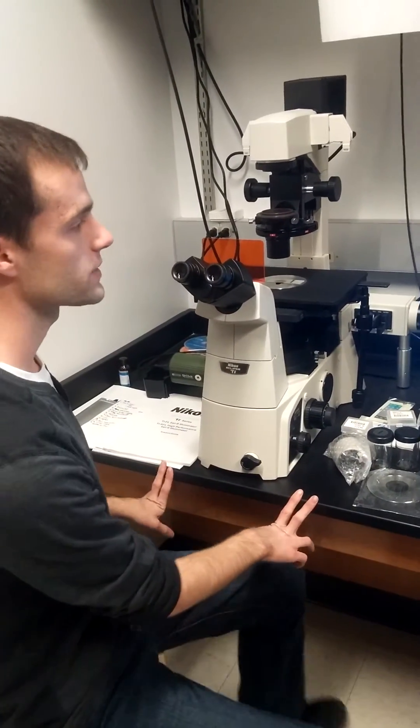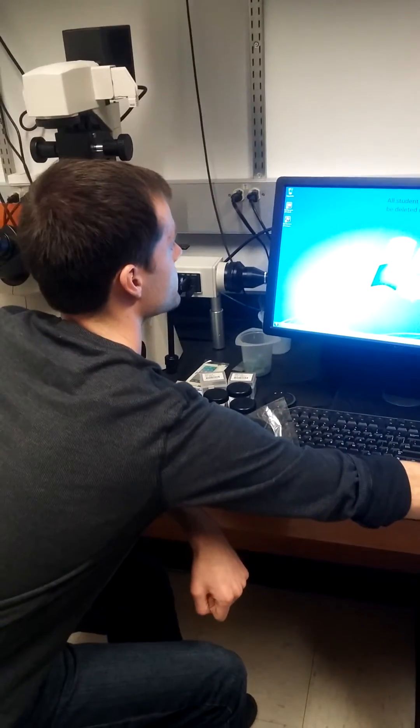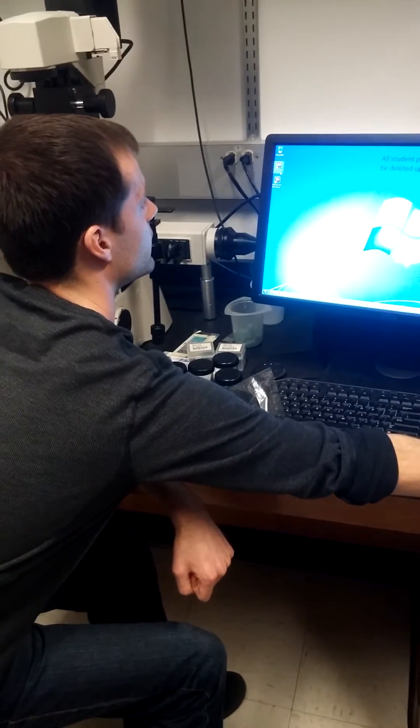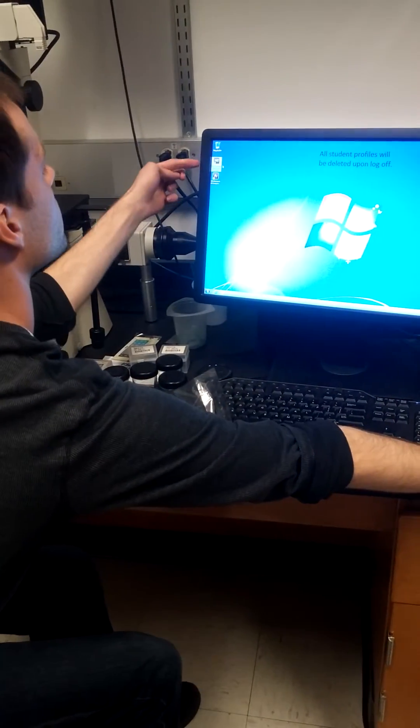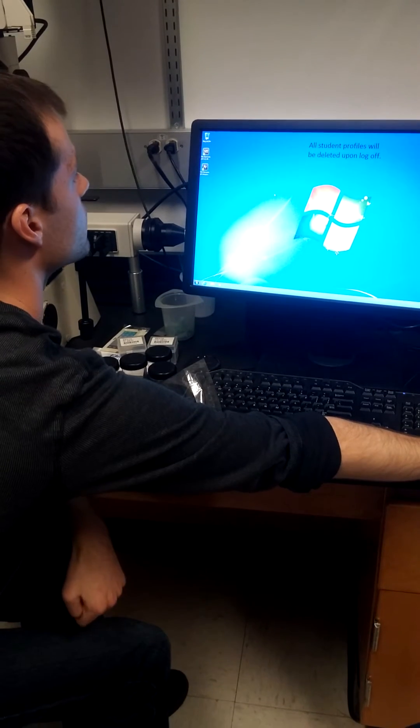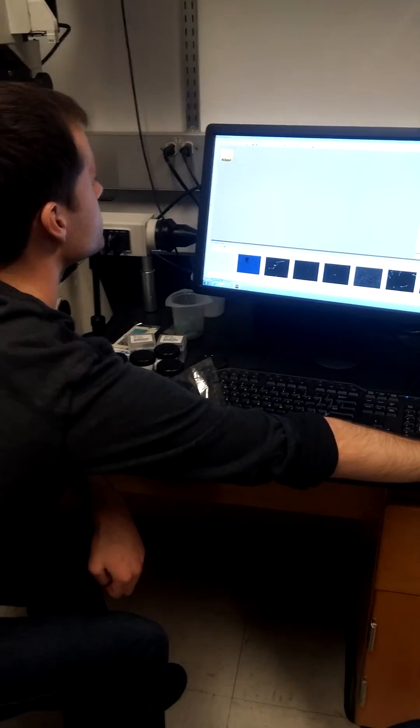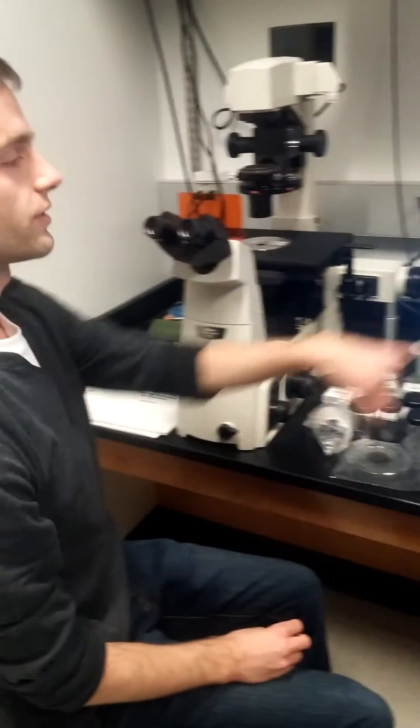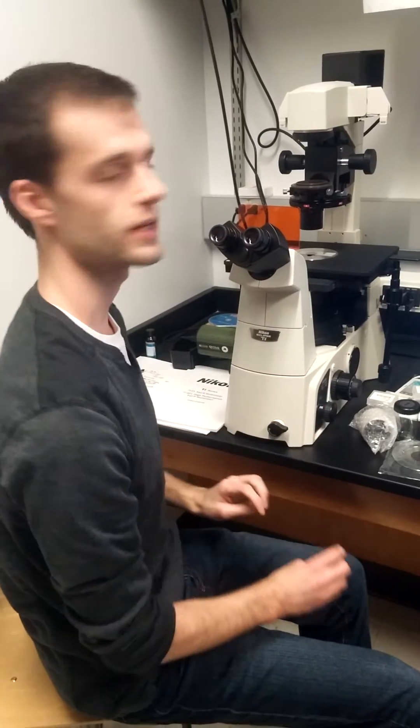So now let's open up the software so we can take an image. So I'm going to go to my desktop and click on the NIS Elements at the top. Right here. Let it load. If the camera's not on, you'll get an error message there. So make sure that you have everything set up.